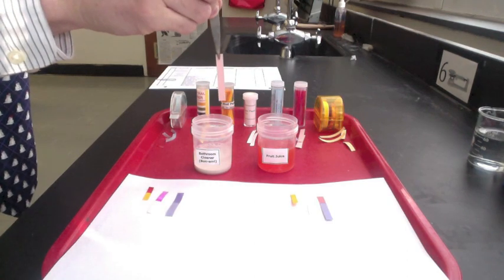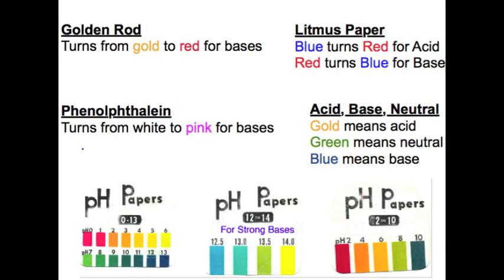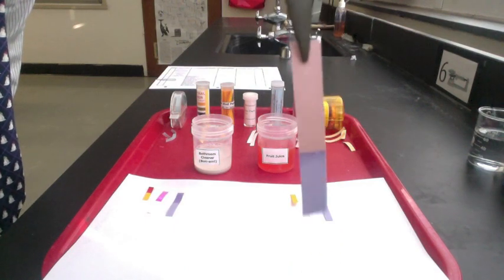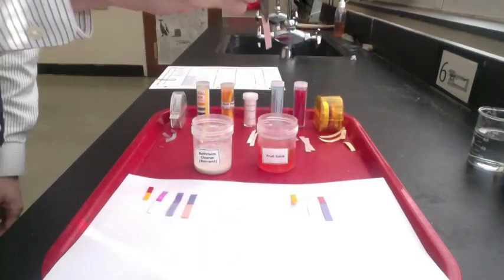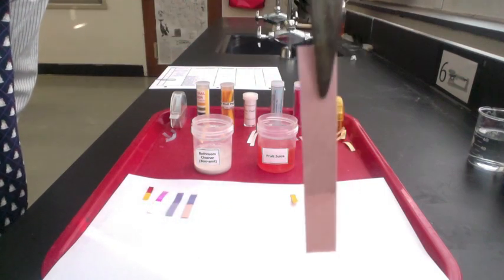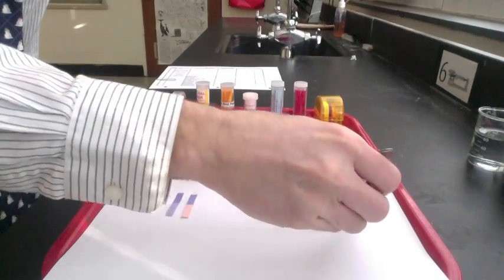Litmus paper also comes in red. Red litmus paper turns blue for bases. When dipped in the cleaner, the red litmus paper turns blue. When dipped in the fruit juice, the red litmus paper stays red, which tells us it's either neutral or acidic.